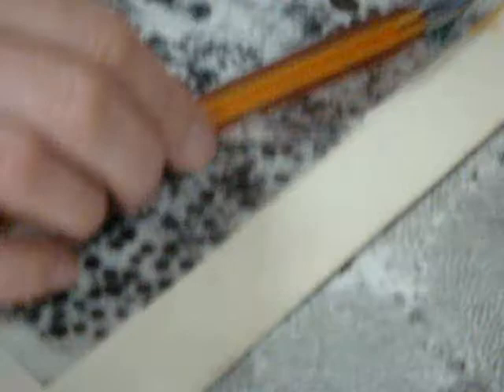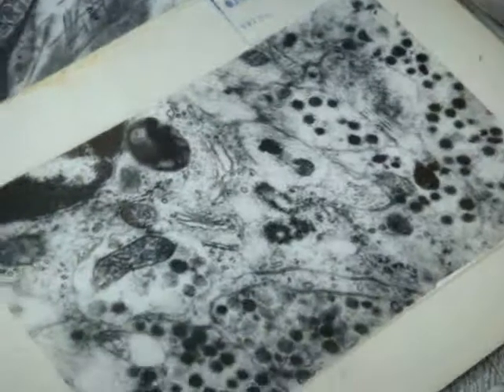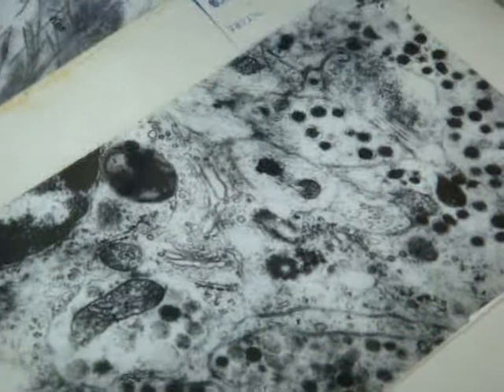What is it? This is the central nervous system, and we can see a lot of nerve processes with mediator, with transmitter inside, that are going to form synapses on each other. Some of them are transparent, some with a dense core. Some, for example acetylcholine, are transparent, and these may be neuropeptides.